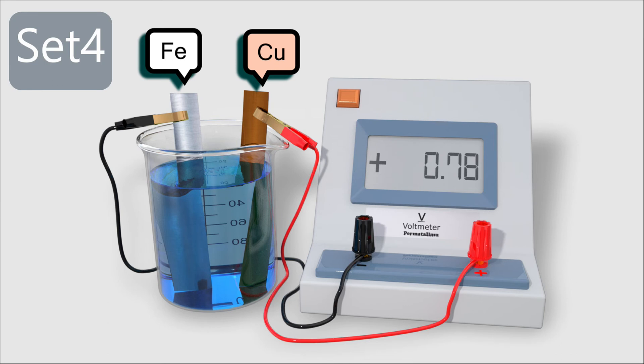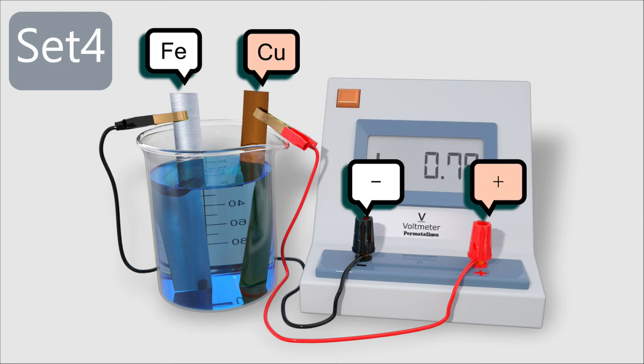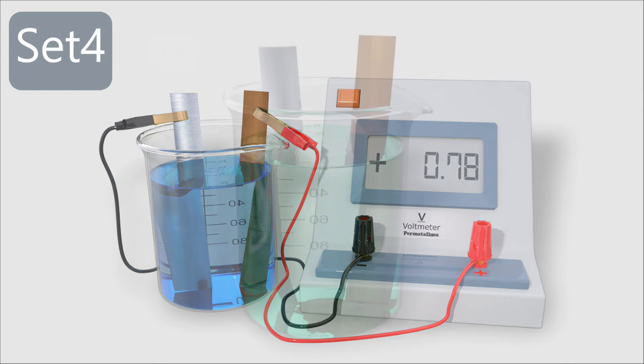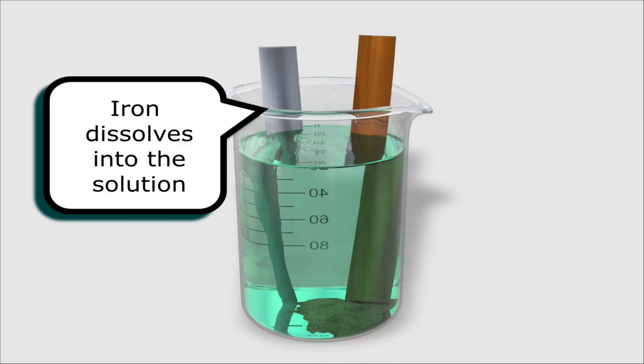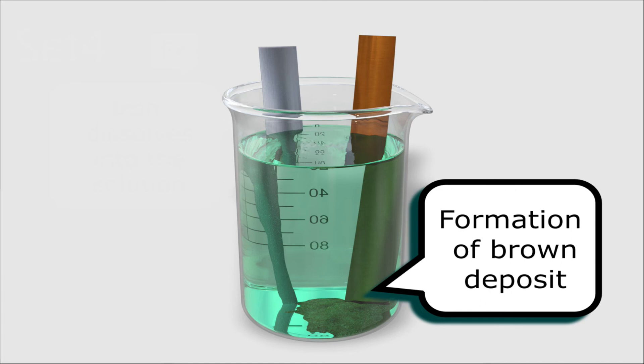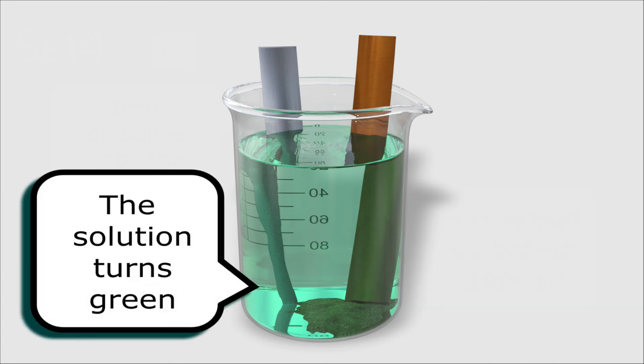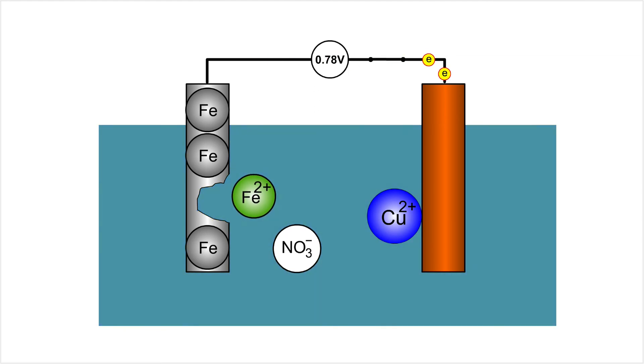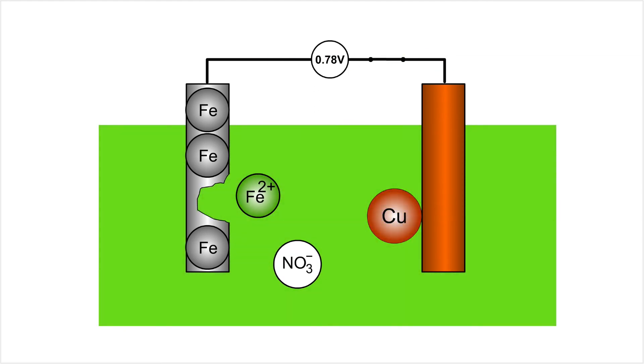For set four, iron and copper sheets are immersed into a copper(II) nitrate solution. Iron is the negative terminal while copper is the positive terminal. The voltmeter shows a voltage reading of 0.78V. The iron electrode dissolves into the solution, a brown solid deposit is formed, and the blue colour of the solution turns greenish. Iron atoms donate two electrons to form green iron(II) ions, and copper(II) ions take two electrons each to form the brown copper metal deposit.